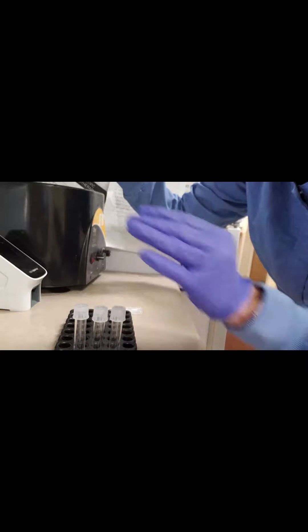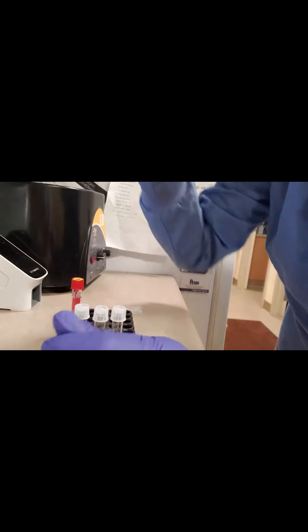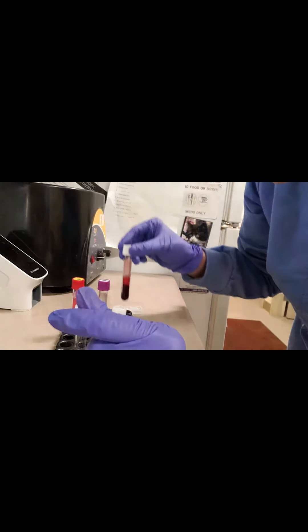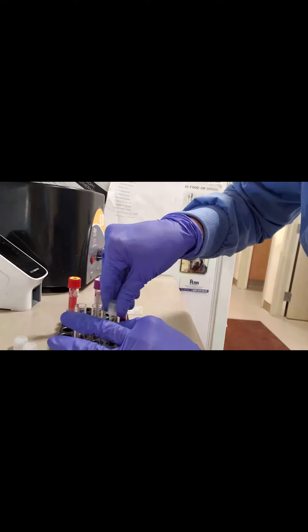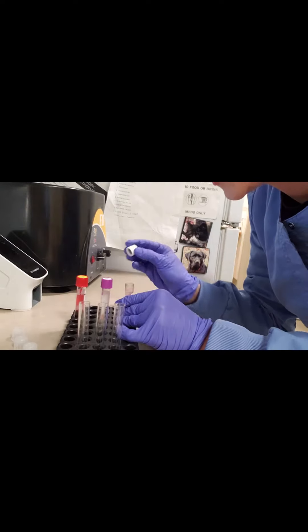Now that our centrifuge has stopped, we'll take out our blood. That's our red top serum separator, and as we can see, it's pretty hemolyzed. We'll discuss what that means in just a minute. Then our lavender top tube — again, pretty hemolyzed. And then our non-additive, also hemolyzed. So let's separate our serum and plasma, and then we can discuss things like hemolysis and lipemia — some of the things that would cause it and why we see it sometimes in samples.